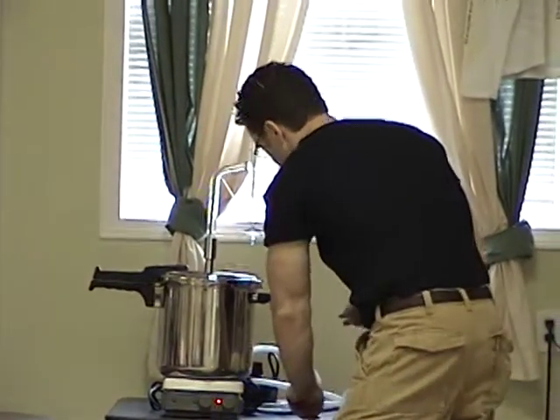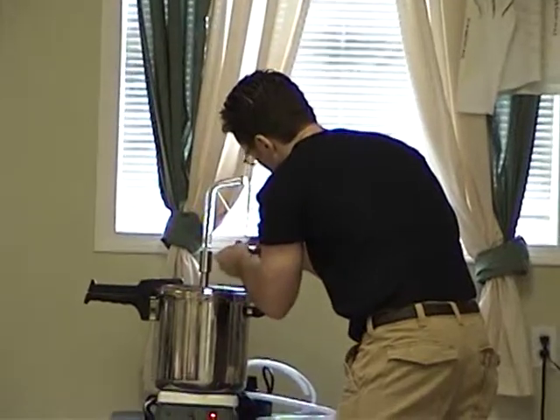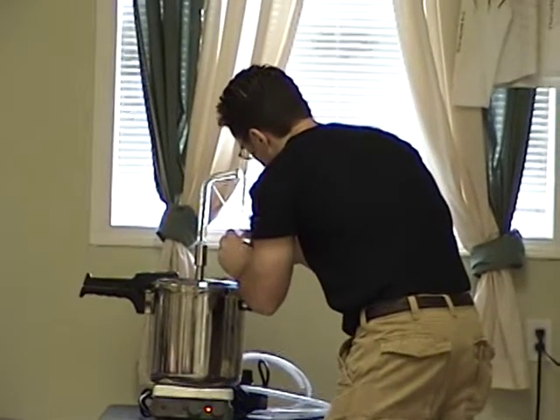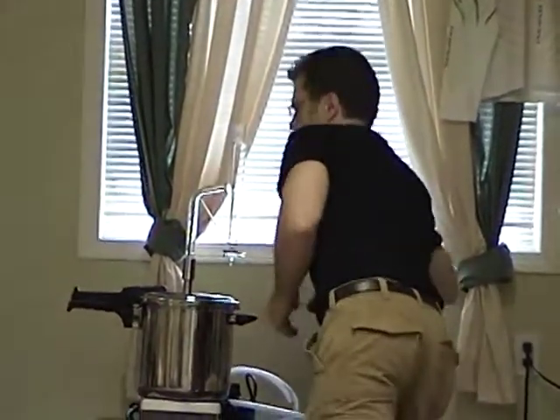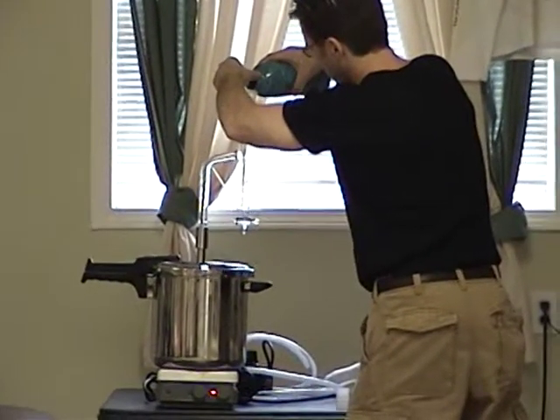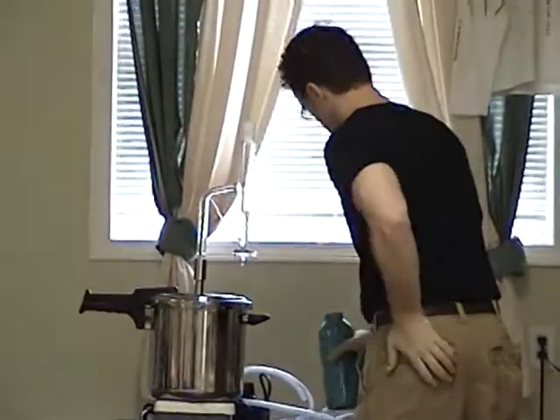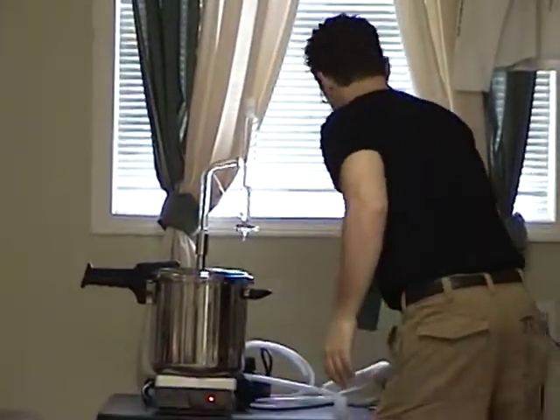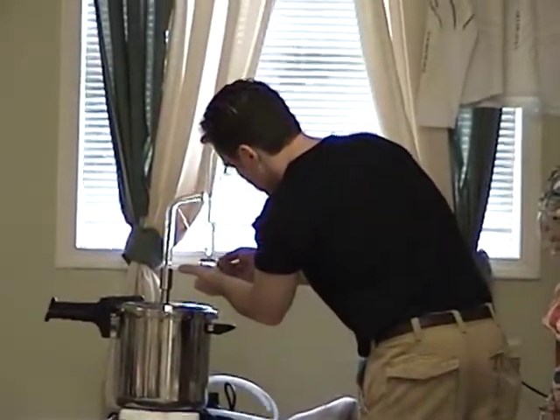I always like to test it — I put some water in there first to make sure it's draining properly. Just put some water in the trap here to test it and make sure that it's draining correctly.